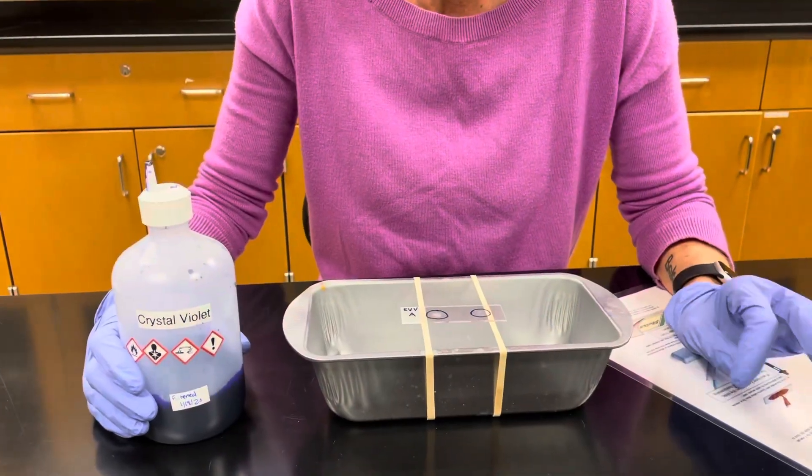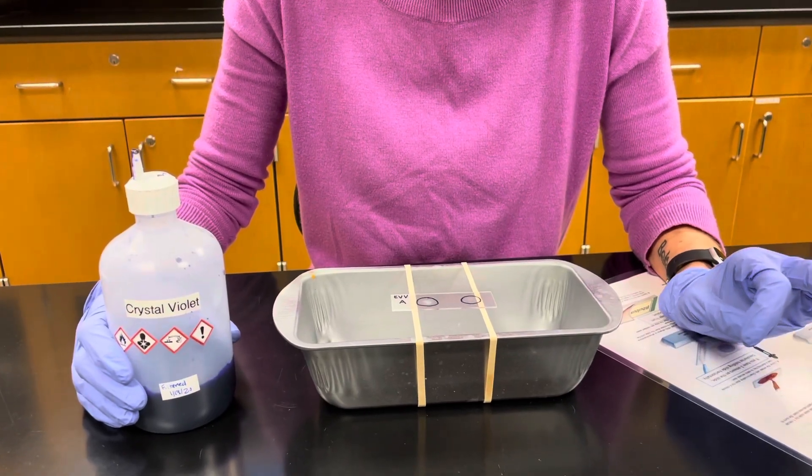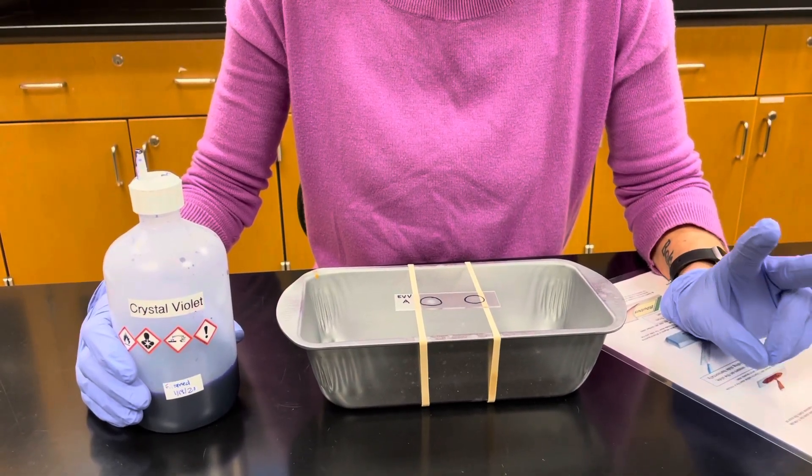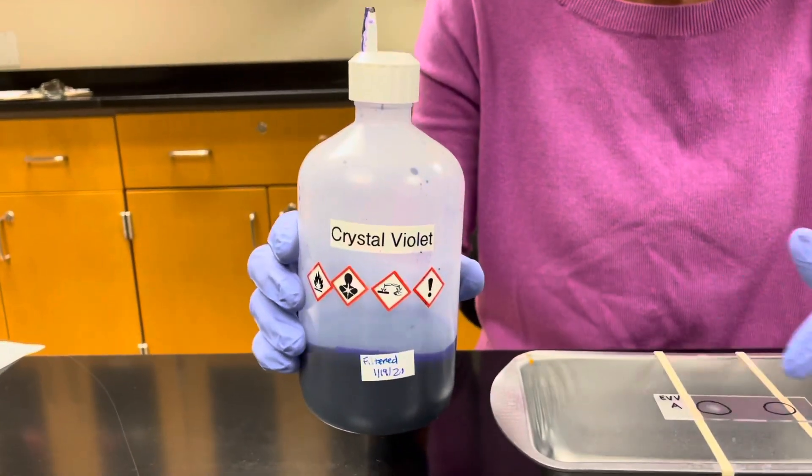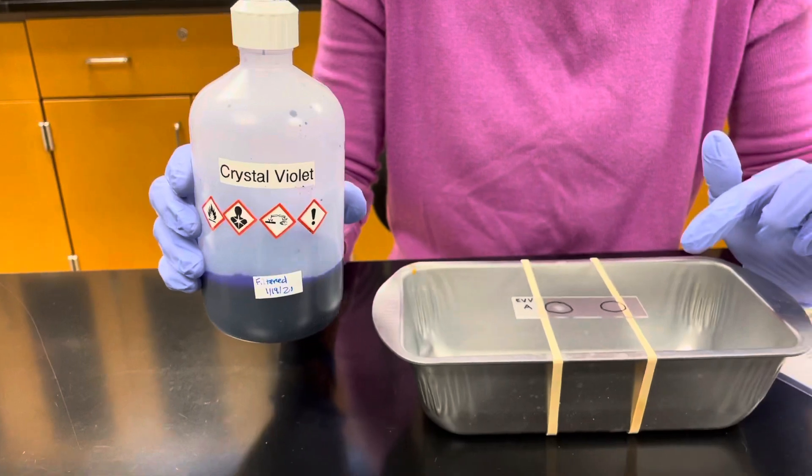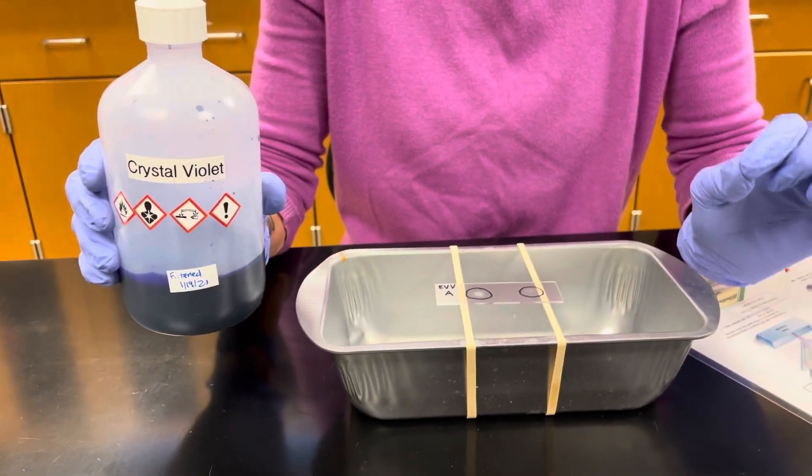The Gram stain is the most widely used differential stain. Two stains are going to be used. The first stain is called the primary stain and that's crystal violet. So we are going to flood our smears with crystal violet and allow it to sit for one minute.